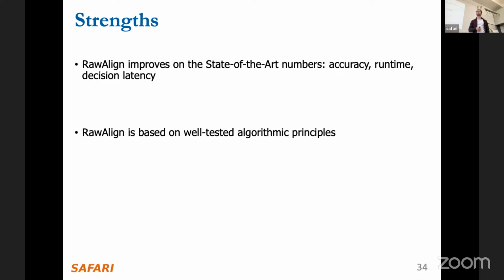I mean, we didn't have to do any voodoo magic, I guess, right? We added alignment that conceptually makes sense because we know it works from base called read mappers that also use alignment for high accuracy. So we can sleep well knowing that we're not doing something weird.